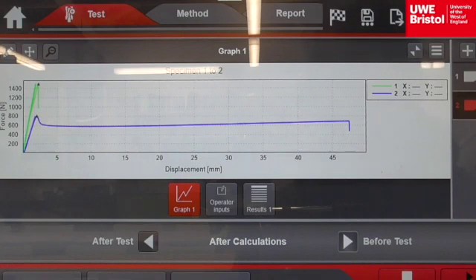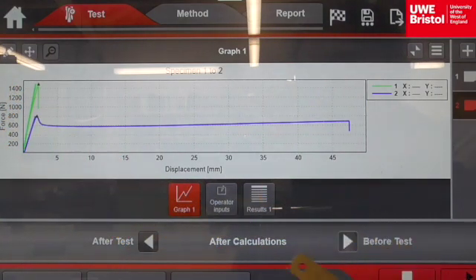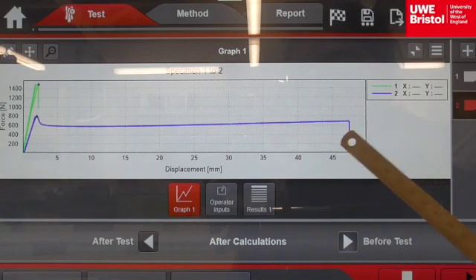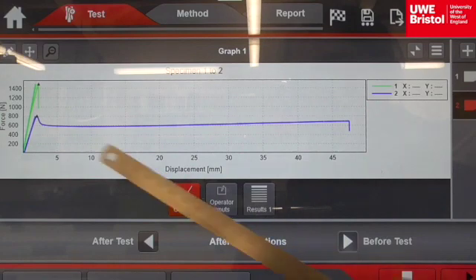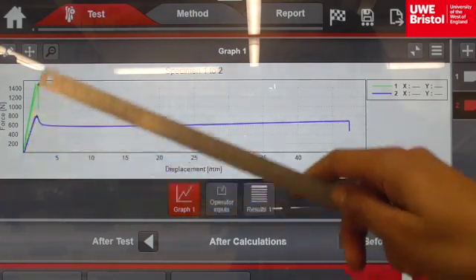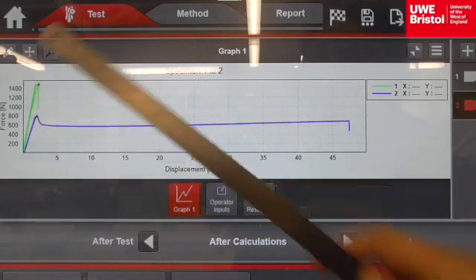Another characteristic visible here is toughness, which is the energy a material absorbs before fracture, represented by the area under a plot. In this case, high impact polystyrene's graph area, when a parallel line against the line of modulus is drawn at the point of fracture, there is a greater area here compared to the green plot, where a similar parallel line against modulus is drawn at its fracture point.